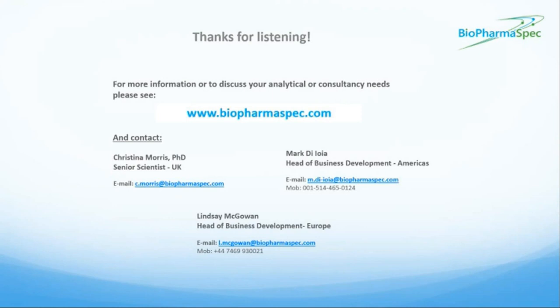MS, on the other hand, can detect a wider population of individual HCPs within a single run. It's also highly sensitive. It identifies individual HCPs, sometimes down to sub 10 ppm or single digit ppm levels, depending on the MS methods that you're using and the instruments you're using. And it's also very flexible once you've actually developed the method.